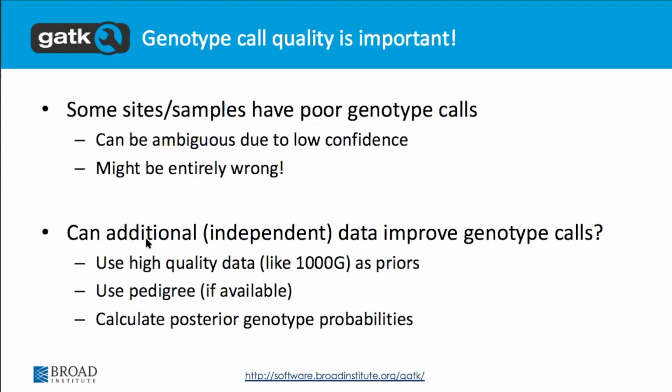So why might we have some uncertainty around our genotype assignments? In some cases, there's just not very good data at sites. There might be some artifacts that make it more complicated. And we saw that problem this morning with the uncertainty around whether our individuals had a GTT or GTTT allele at the site that they're mutated at. So there can be an ambiguity.